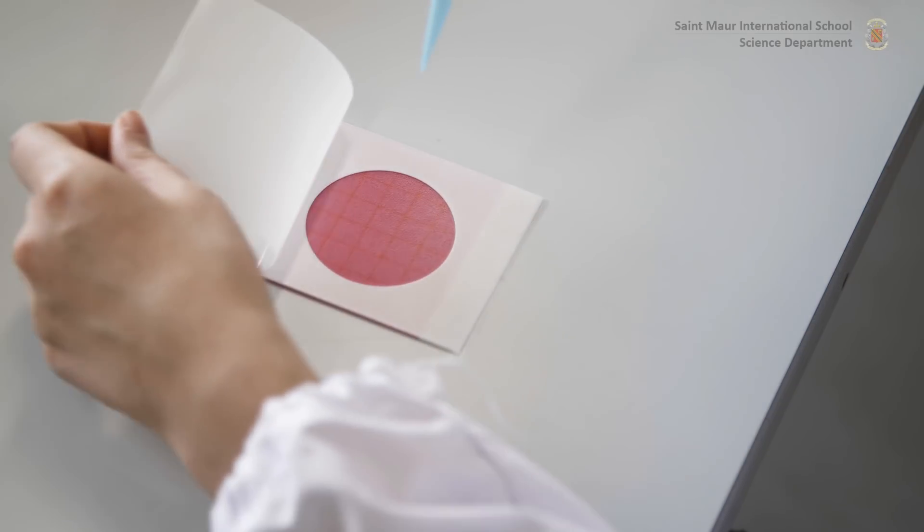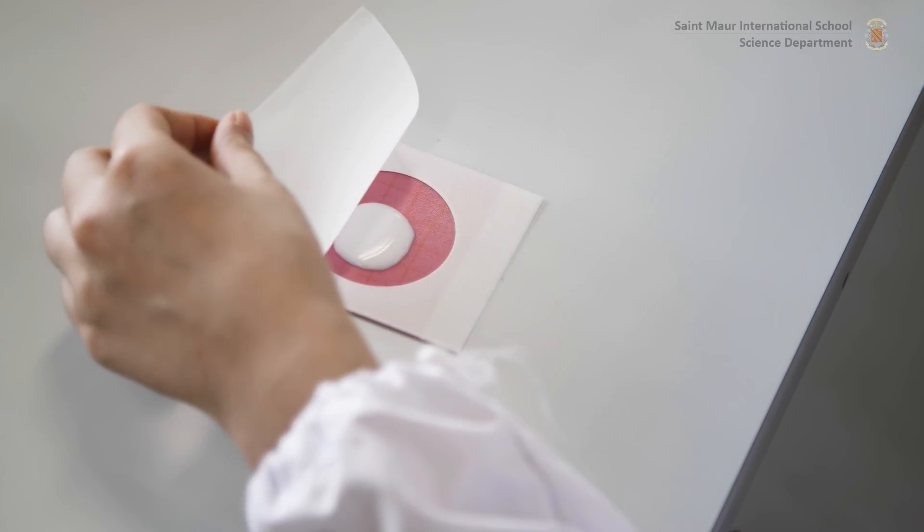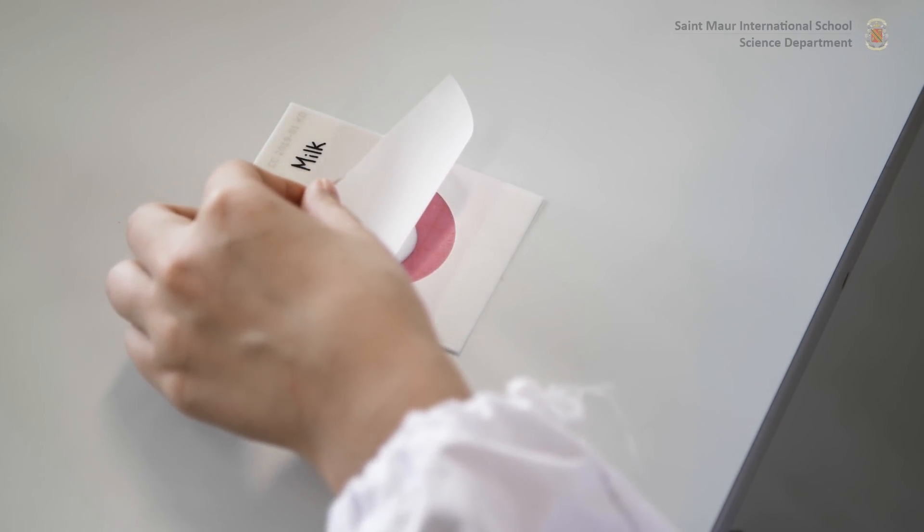For liquid inoculum, lift the cover and pipette 1 milliliter directly on the surface of the Petrifilm. Place the cover back on.